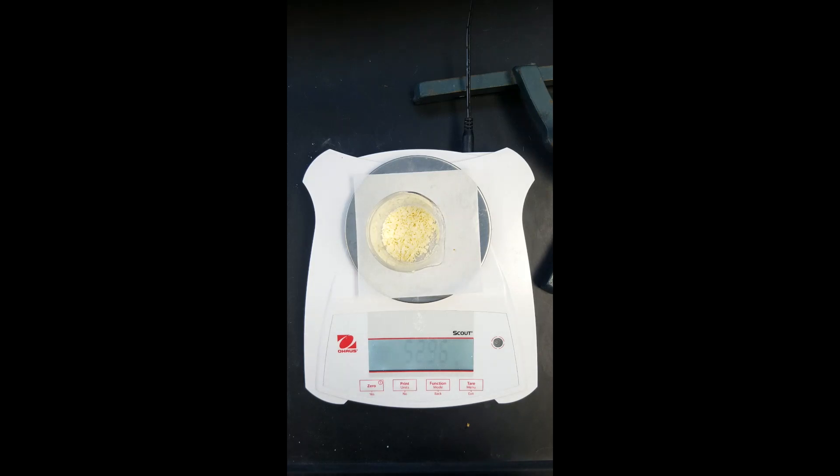You should be able to use this data now to figure out the percent error of your fat found in your potato chips.